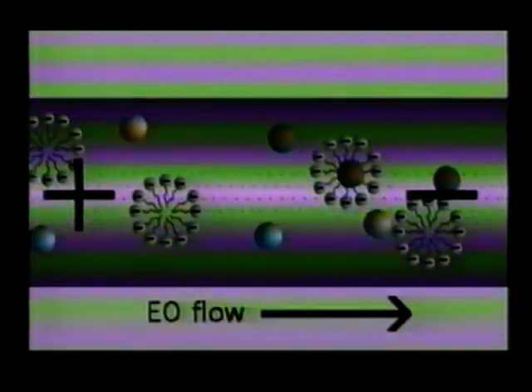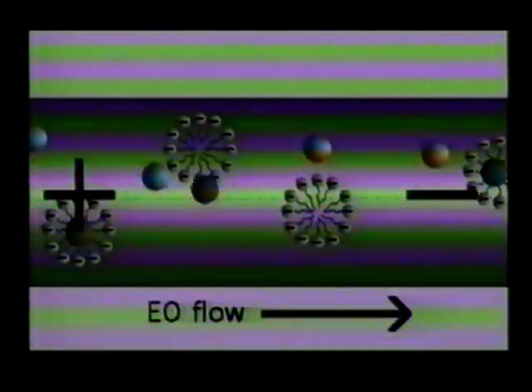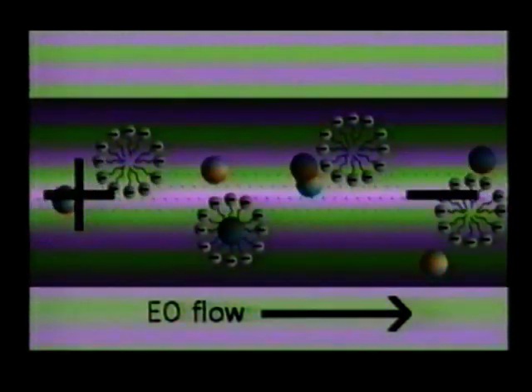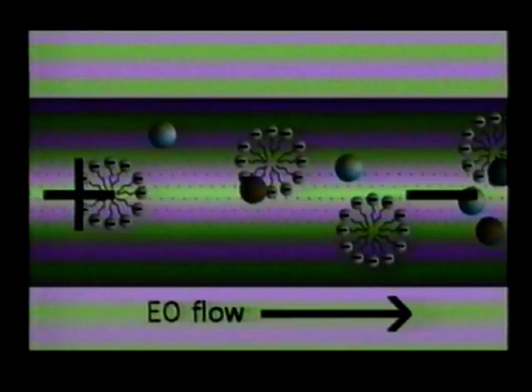In MECC, molecules can be separated by virtue of the partitioning of the various components between the aqueous mobile phase and the hydrophobic interior of the micelles present in the electrolyte and forming the pseudo-stationary phase. The more hydrophobic a non-polar molecule, the more time it spends within the micelle. Because electroosmotic flow is in the direction of the cathode, even though the negatively charged micelles attempt to migrate towards the anode, they generally have a net movement towards the cathode.